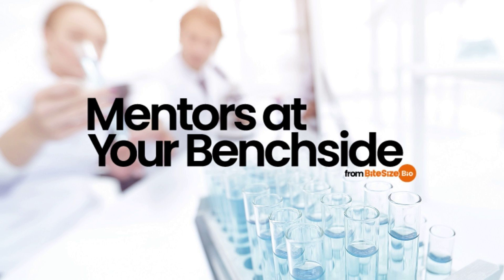If your bacteria form biofilms or aggregates in solution, this will severely affect the accuracy and precision of your measurement. In this situation, you might need to sonicate or further process the culture to break apart these clumps. Check the literature regarding the bacterial strain you're working with to avoid or negate this problem.